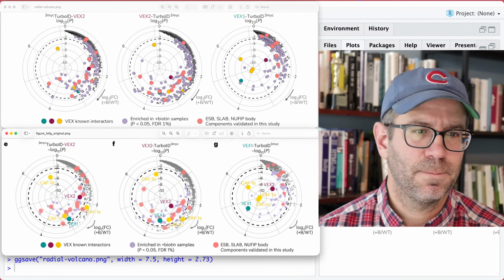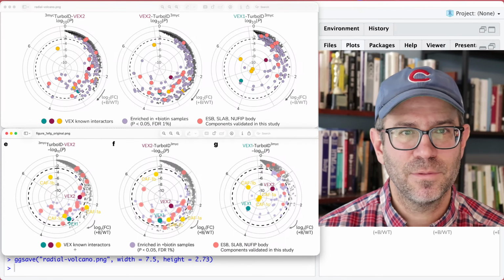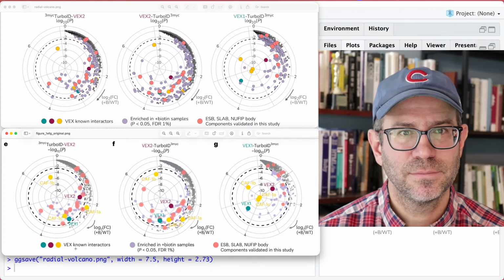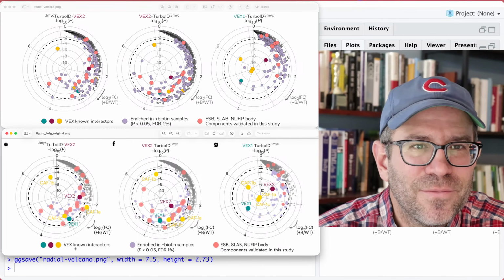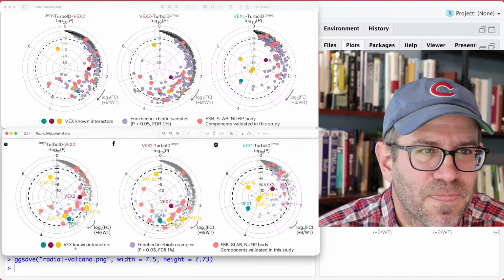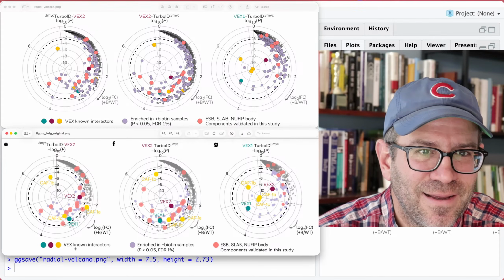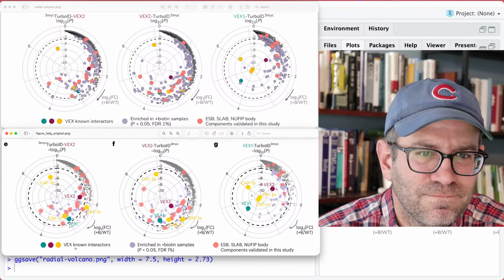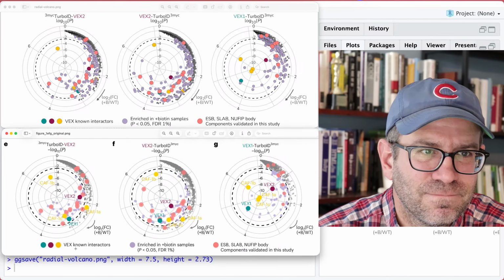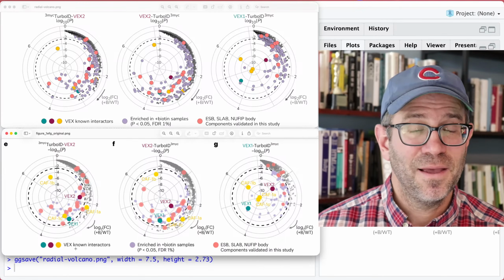So, all right, I think that's pretty good. Now I'm confusing myself again. So as I look at this, no, that's right. Okay. Yeah, I'm getting confused.